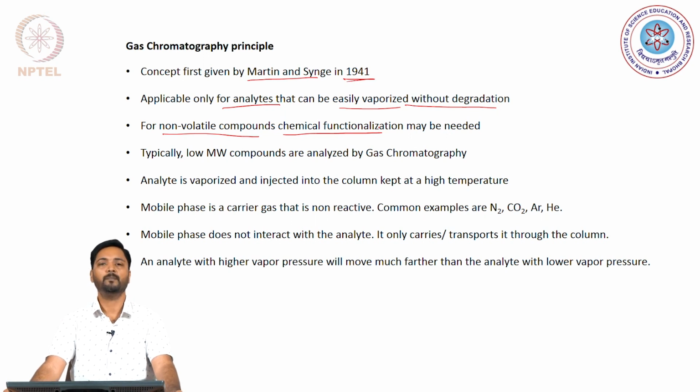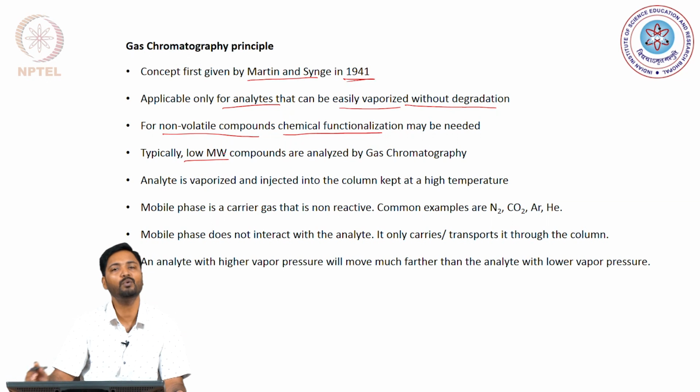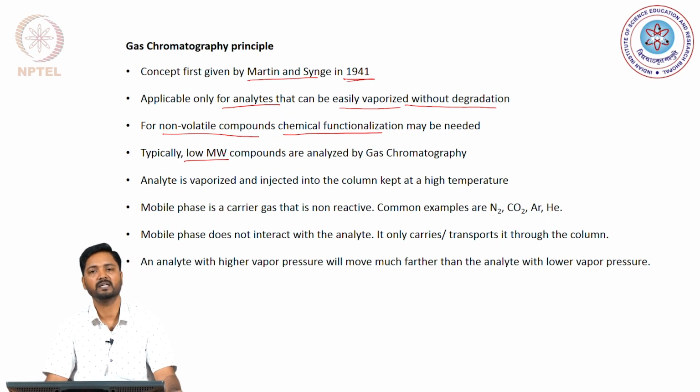Now, given this requirement for gas chromatography, it is not surprising that gas chromatography will be applicable only to molecules that have low molecular weight, and these are the main analytes analyzed in gas chromatography.